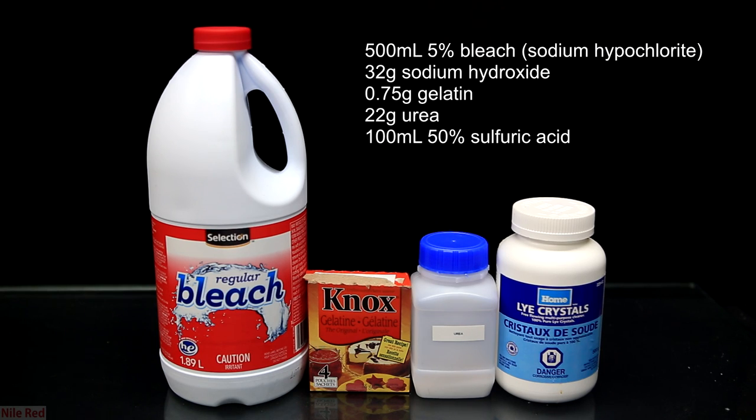These are all of the ingredients needed to make hydrazine except I forgot the sulfuric acid — let's just pretend that it's there. The procedure was adapted from ChemPlayer and it's pretty much the same. What I used was 500 milliliters of approximately 5% hypochlorite, 32 grams of sodium hydroxide, 0.75 grams of gelatin, 22 grams of urea, and 100 milliliters of 50-50 sulfuric acid.